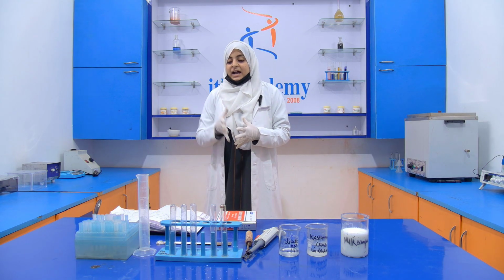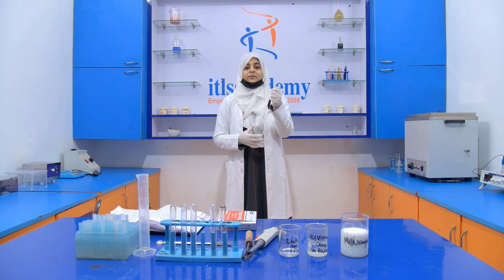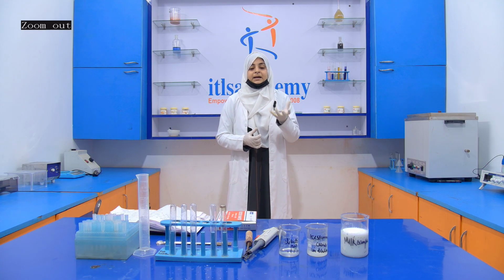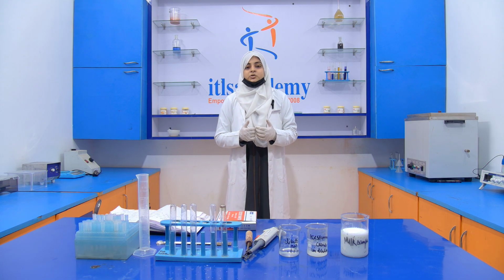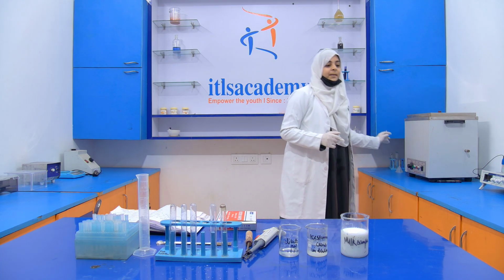And if mercuric chloride is present, then a gray color appears. This gray color indicates the presence of mercuric chloride. So let's start the experiment.